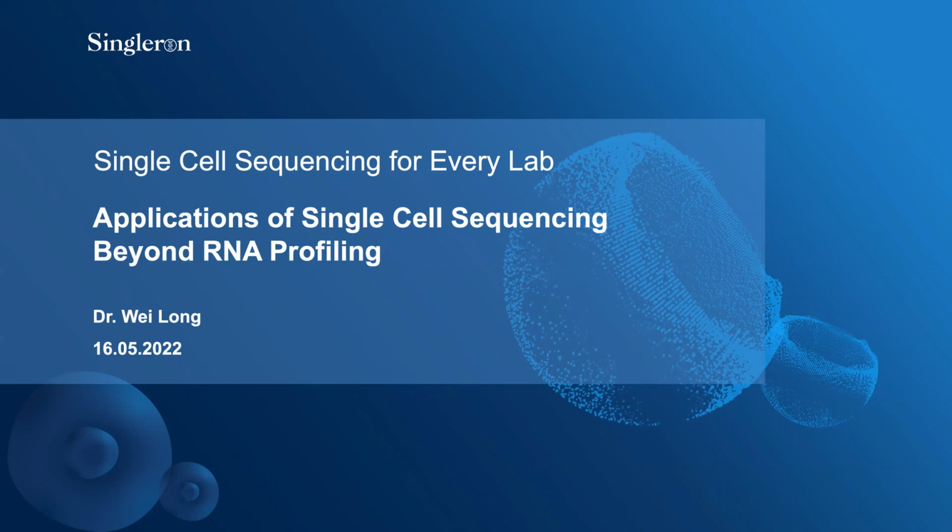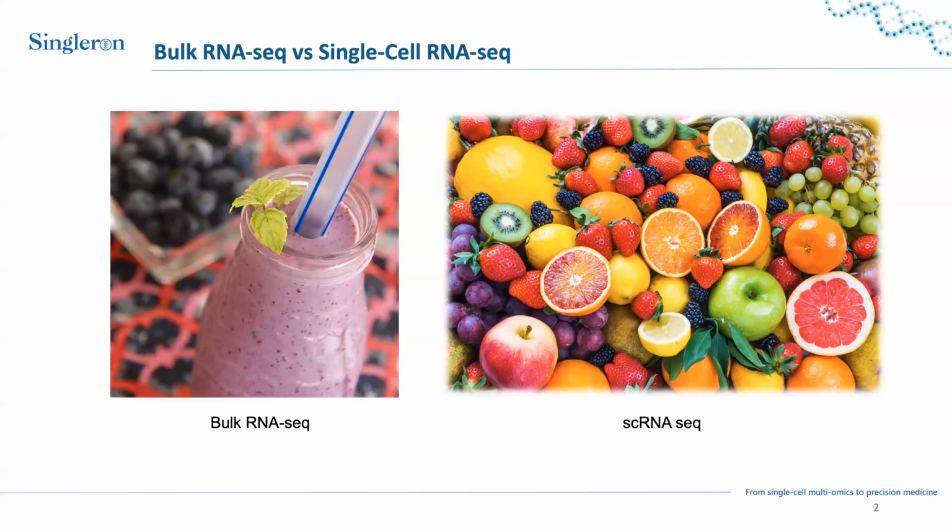So also from my side, welcome everybody to my presentation. I will start my presentation with a very short introduction to single-cell sequencing. When we try to visualize single-cell sequencing, we usually compare normal bulk RNA sequencing to a smoothie. You will use a lot of different fruits, but in the end you will taste an average.